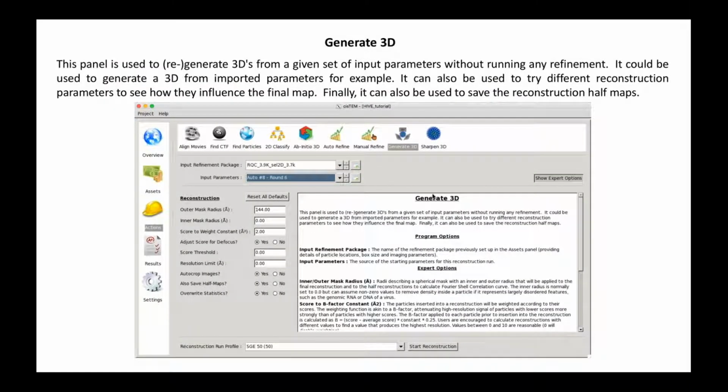One of the metrics that we follow to see if a map is good is the FSC curve. To make a gold standard FSC curve, you split your particles that went into this 3D refinement into two groups, and you refine them independently and then compare them. You compare against each spatial frequency, so at each resolution shell you're comparing them, and you see where the correlation drops off, and that's how we determine the resolution. That's what the half maps are used for. This is the gold standard resolution that is currently accepted to measure resolution in cryo-EM.